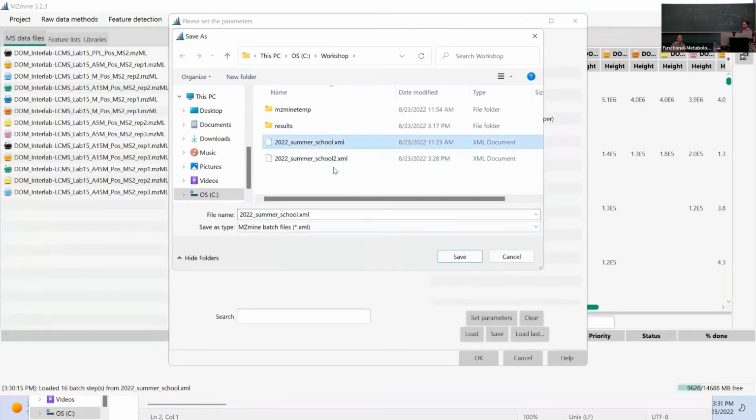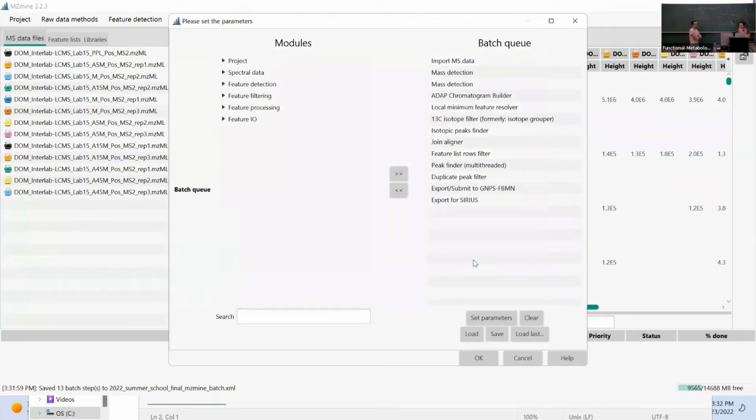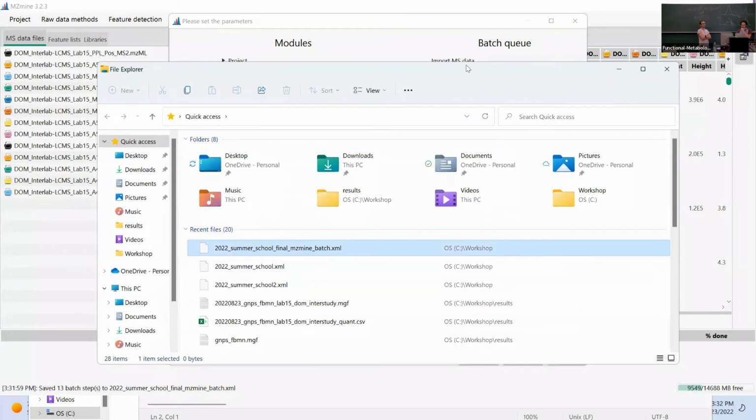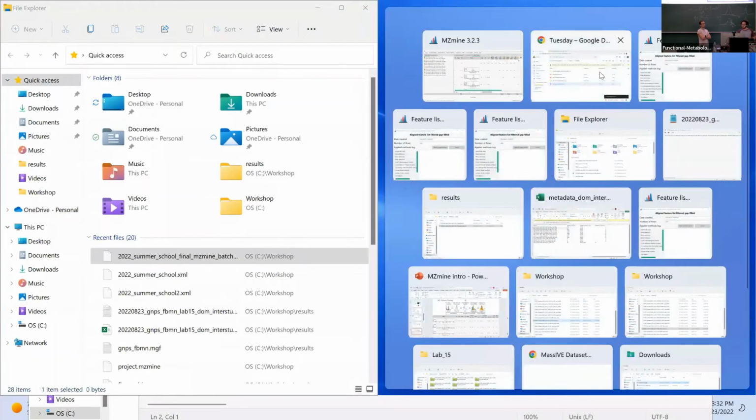I think this is really important. Also, if you start with metabolomics data analysis, especially the beginners, be aware that this is frequent. This can screw up your entire downstream analysis. We want to equip you with, in our opinion, the best tools. But here feature finding is really an important step where you can easily do things wrong. So yeah, just to reiterate on that.